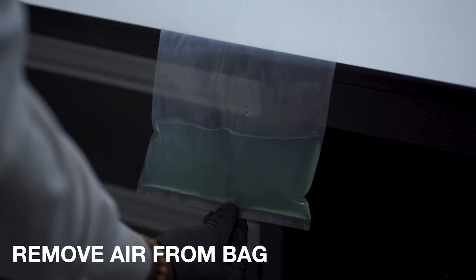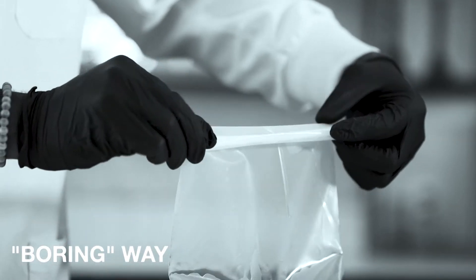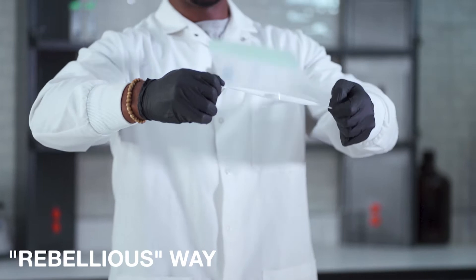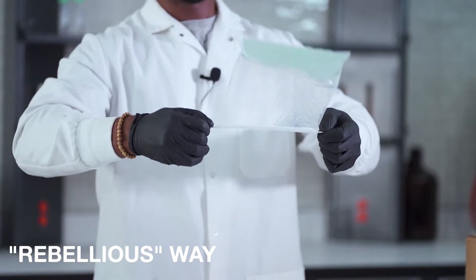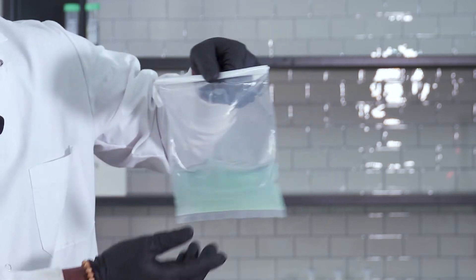Let's remove the air from the bag. Now there's two ways to secure the bag: there's the boring way, then there's the rebellious way. Don't forget to close the sides. It's clean, secure, and it can withstand pressure.